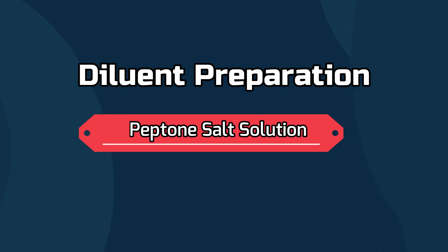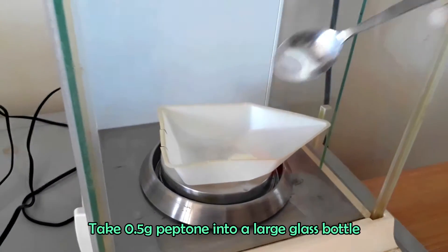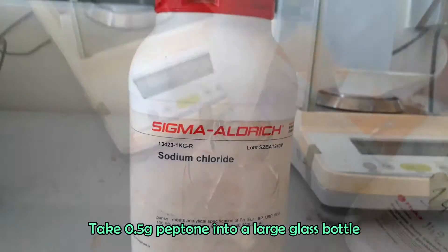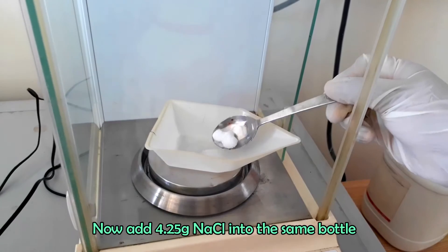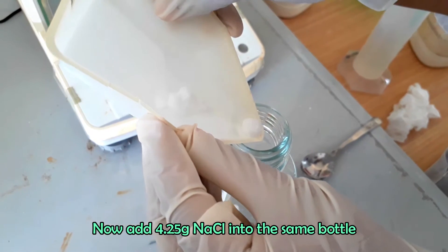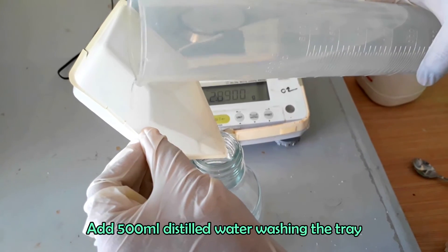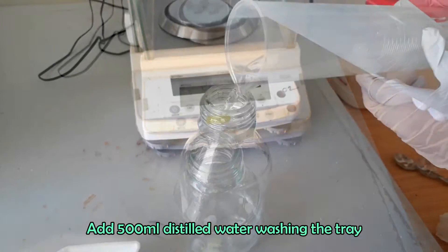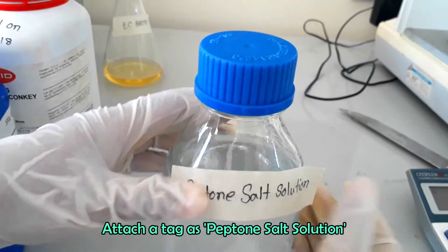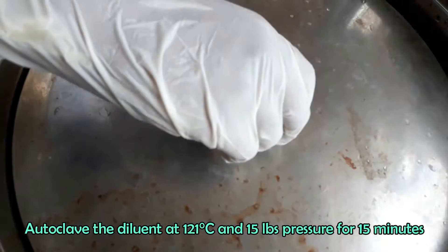Now we will prepare the diluent. Take 0.5 gram peptone into a large flask. Now add 4.25 grams of sodium chloride. Dissolve the content in 500 ml distilled water. Shake to mix well. Autoclave the peptone salt solution at 121 degrees Celsius and 15 pounds pressure for 15 minutes.